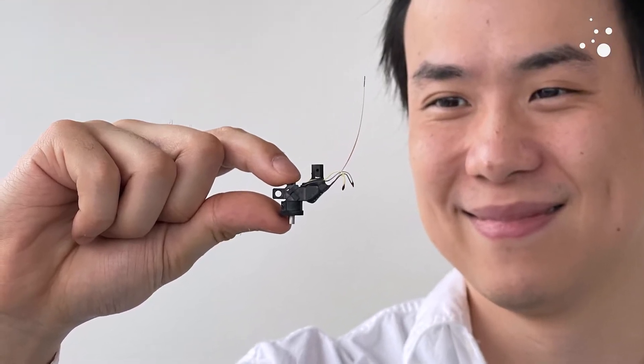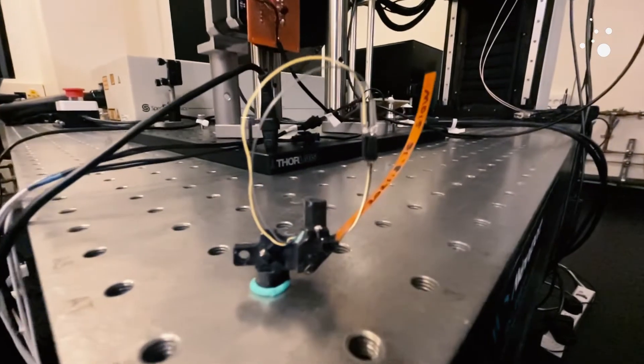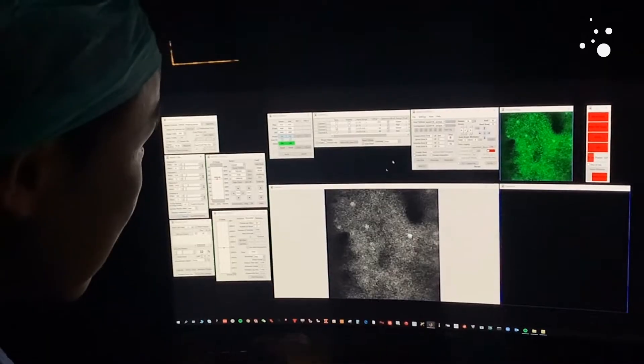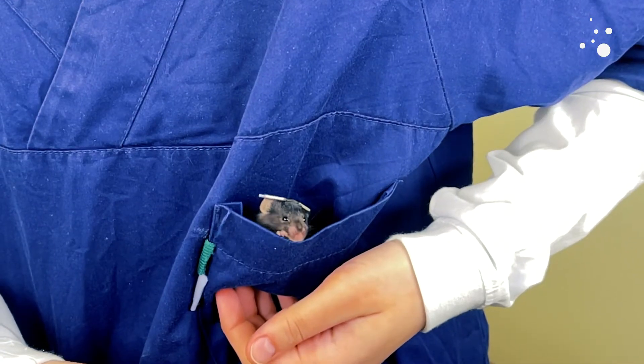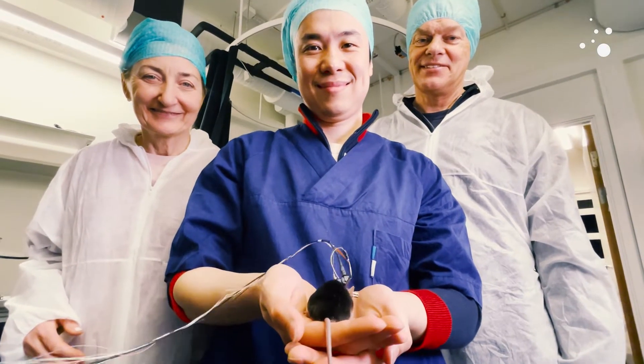Meet Mini2P. Mini2P is a tiny brain explorer developed at the Kavli Institute for Systems Neuroscience at NTNU in Trondheim that allows us to discover completely new aspects of a living brain in action. This is Leif Eriksson the mouse with a window on his head. Here, he's equipped with the Mini2P.